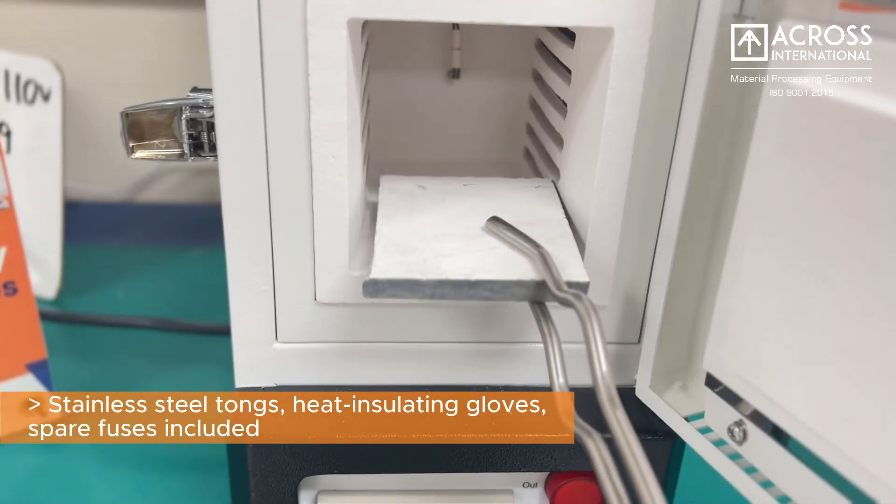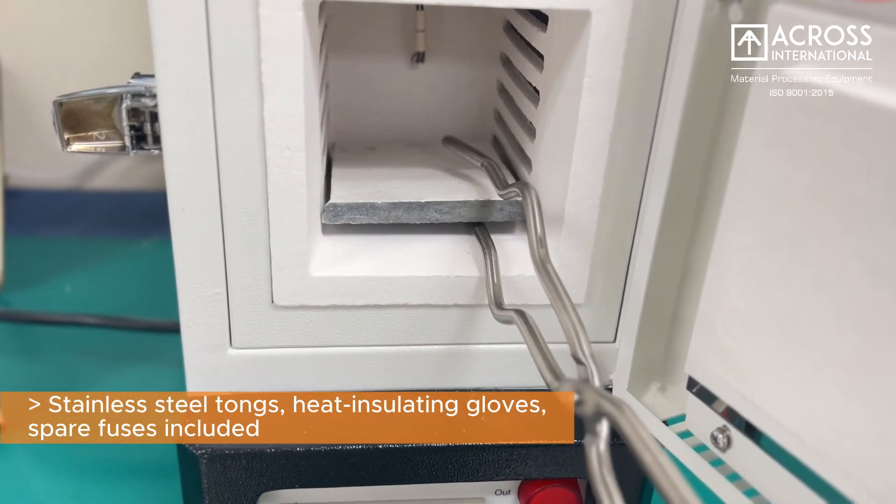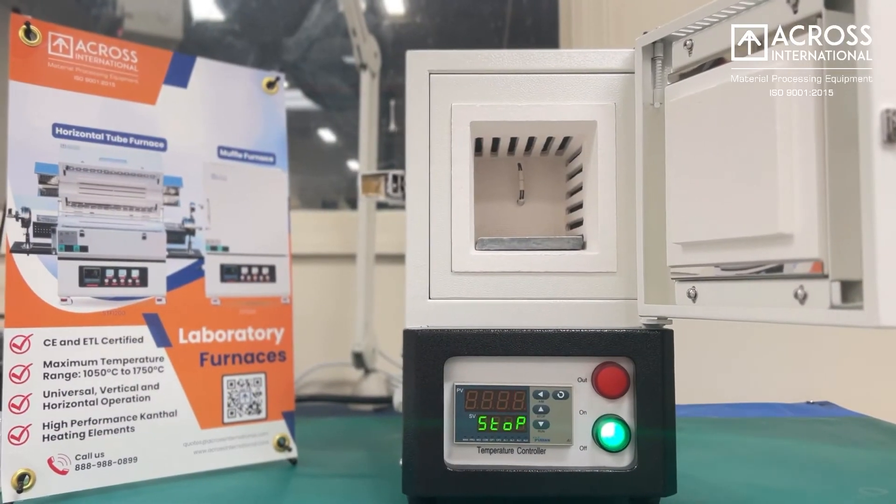Each includes stainless steel tongs, heat insulating gloves, spare fuses, and everything needed to get started.